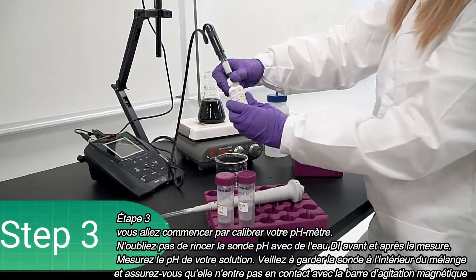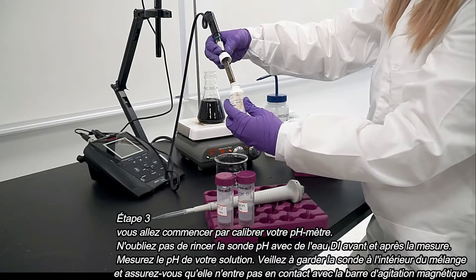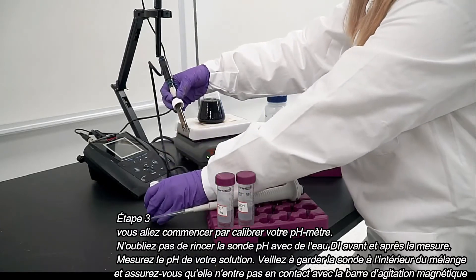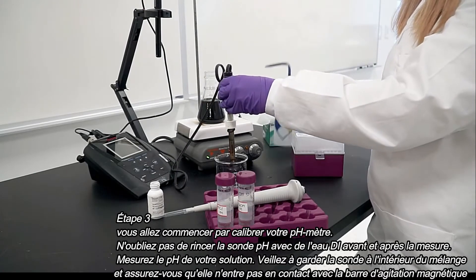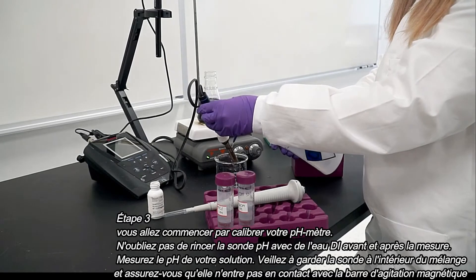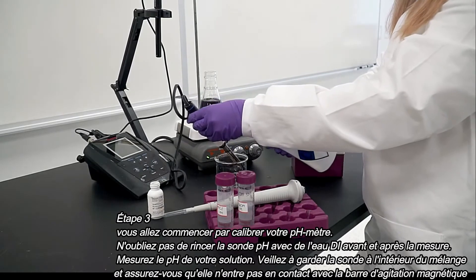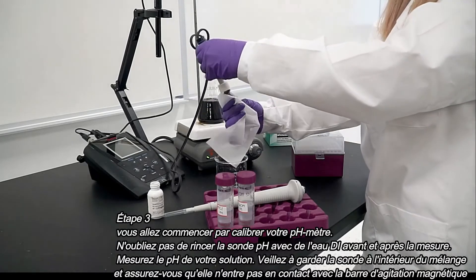Step three: you will begin by calibrating your pH meter. Remember to rinse the pH probe with DI water before and after measuring. Measure the pH of your iron chloride solution, green tea extract, and the mixture. Make sure to keep the probe inside the mixture and ensure that the magnetic stirring bar does not touch the pH probe.